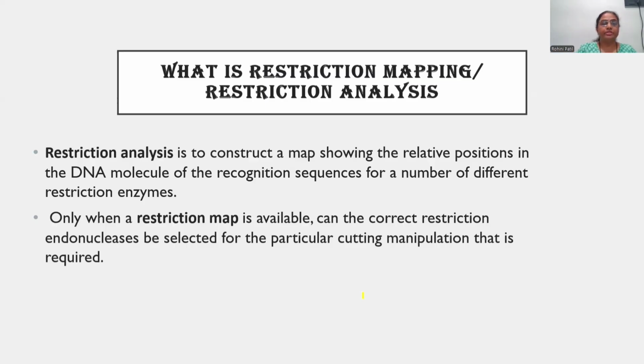Restriction analysis or restriction mapping is to construct a map showing the relative positions in the DNA molecule of the recognition sequences for a number of different restriction enzymes. Now, what do you mean by this?